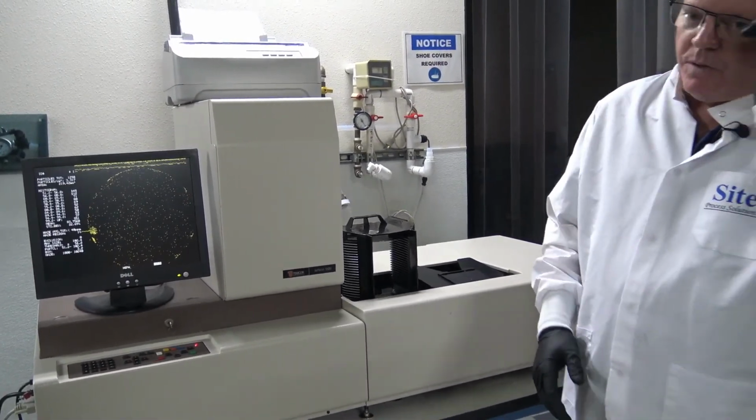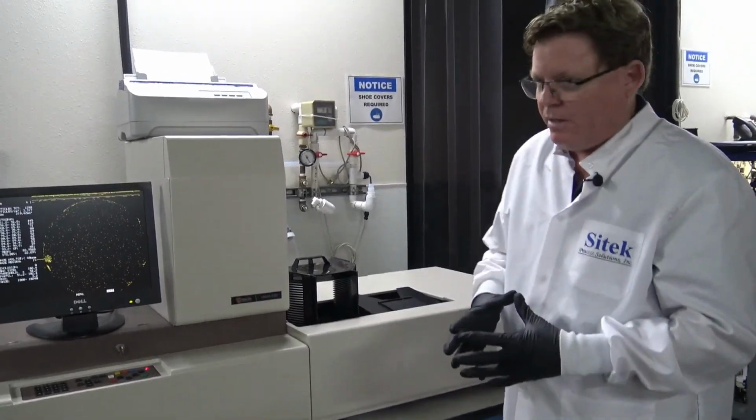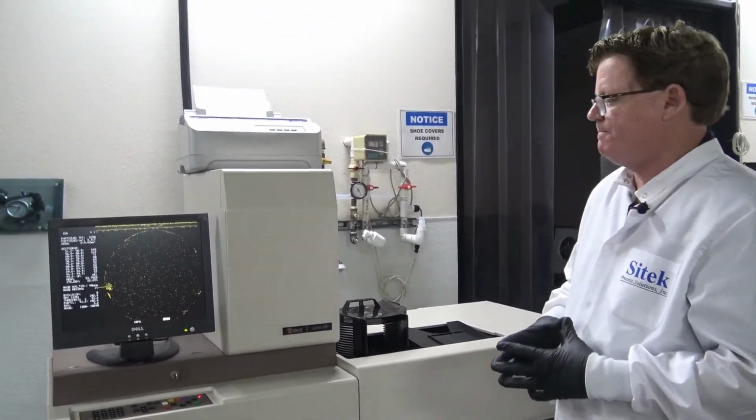Luckily, the customer is familiar with the Tencor Surfscan, so there will be no training needed. They are very aware of all the processes and how it works.